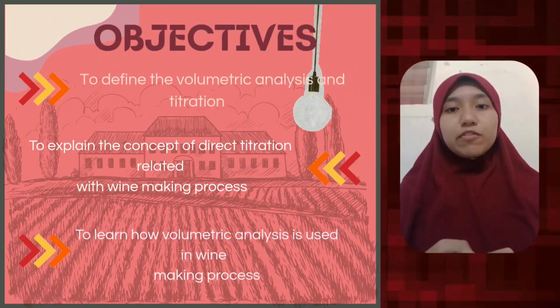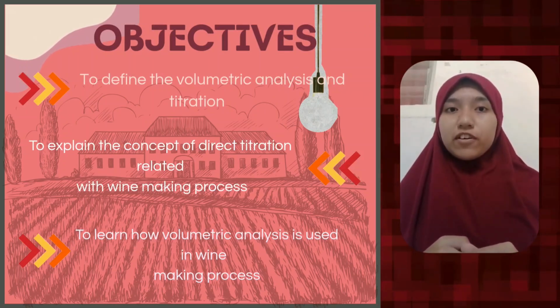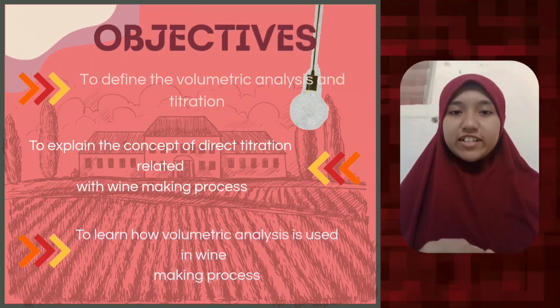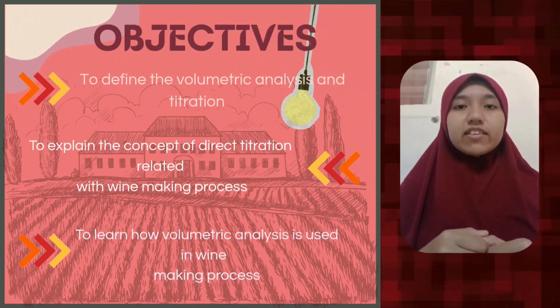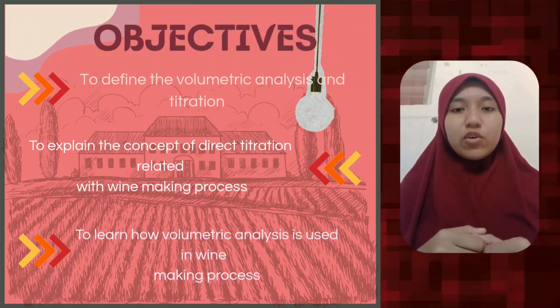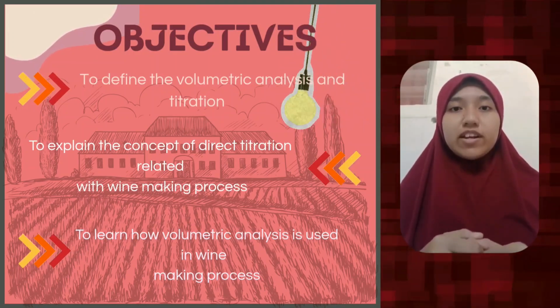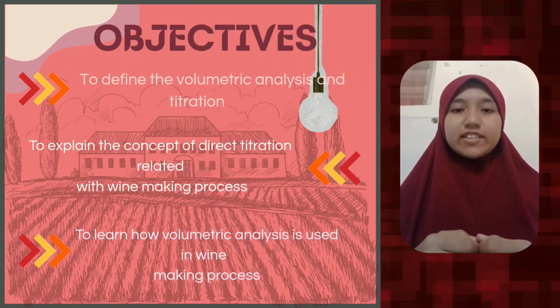First, let's move on to our objectives of the video. First of all is to define volumetric analysis and titration. Second, to explain the concept of direct titration related with the wine making process. Lastly, is to learn how volumetric analysis is used in the wine making process.